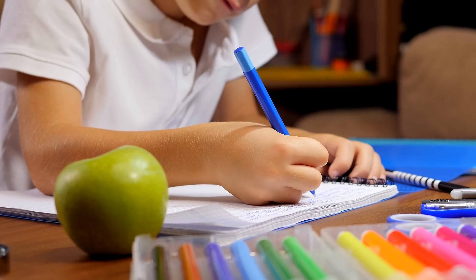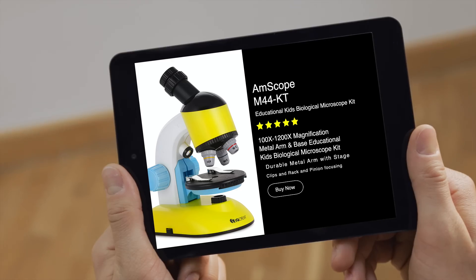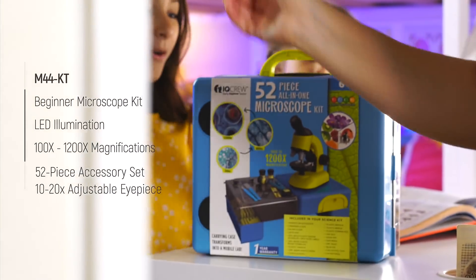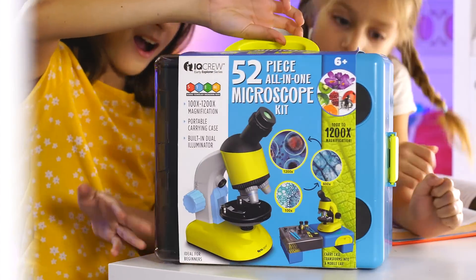I'm all about my kids exploring, learning, and growing. That's why I found the perfect solution — the new M44, a 52-piece all-in-one microscope kit from IQ Crew by Amscope. It's a complete, quick, and easy solution for fun and learning.